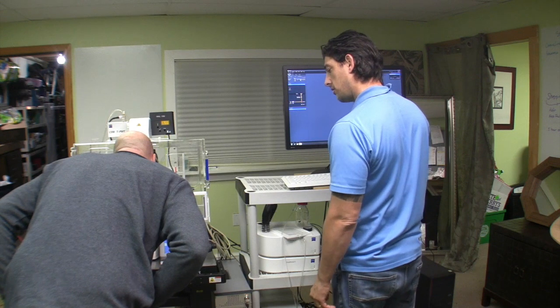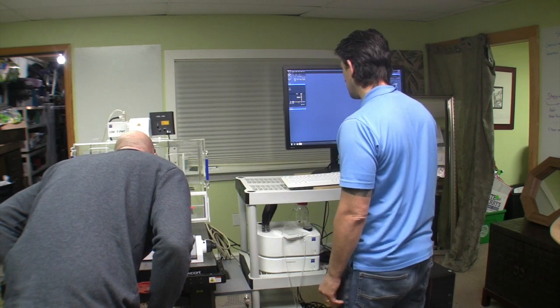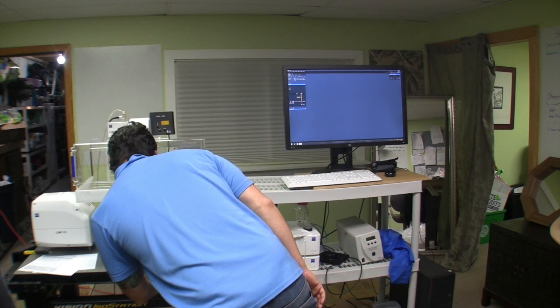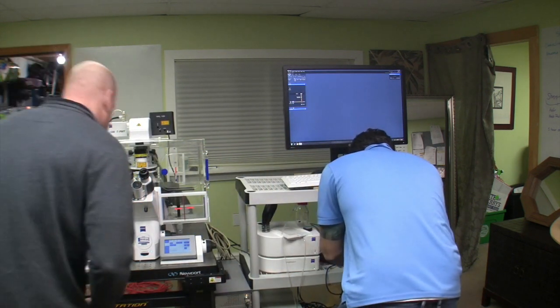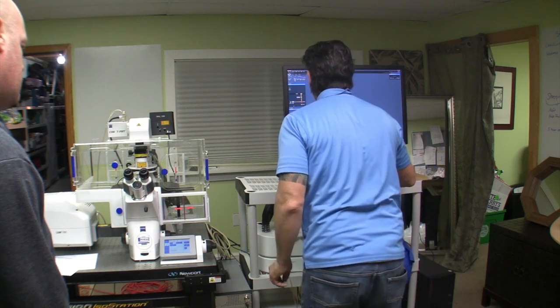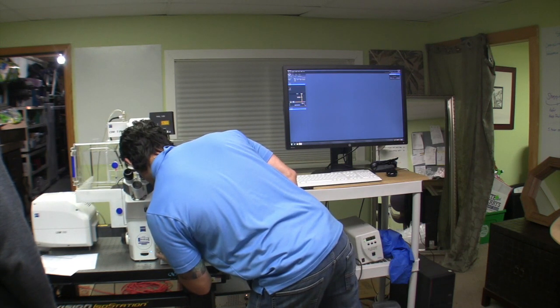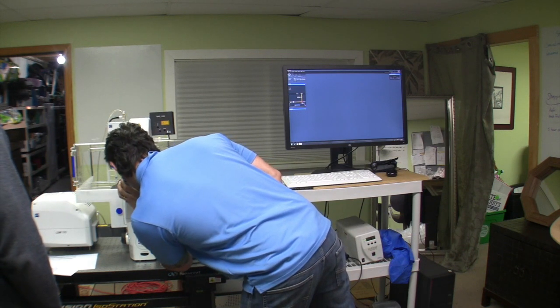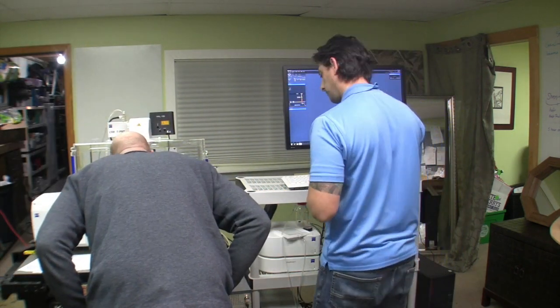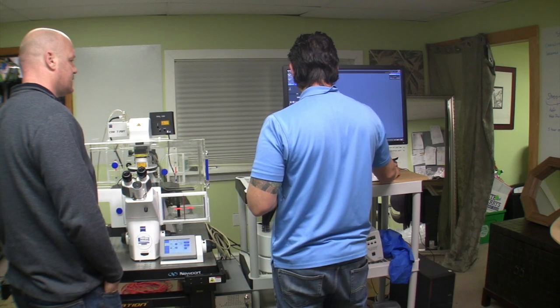And then you can change different color, right? Green to red. Yep. Blue. Kind of lost it. It's probably just the sample is not good for. Lend a little heat to it. Yeah, it's just the lamp intensity. Yeah, it's in there. There we go. That's really interesting. What is that? Convoluted. Yeah, that's all I ever look at.